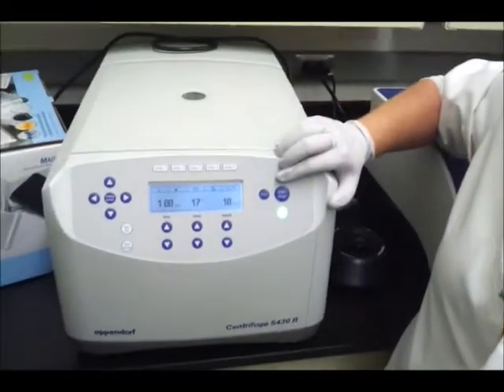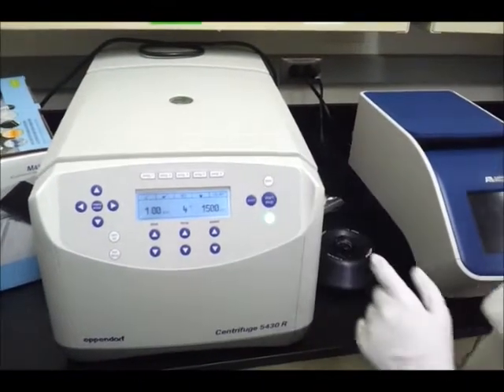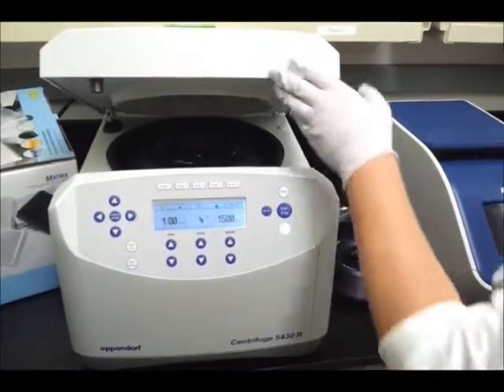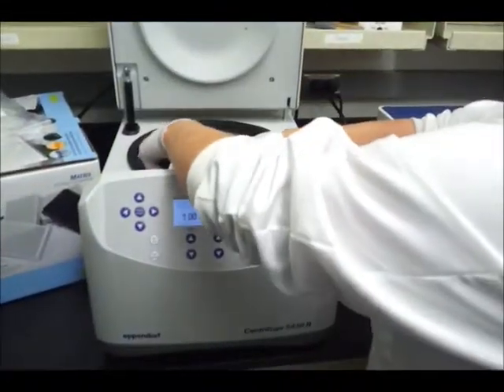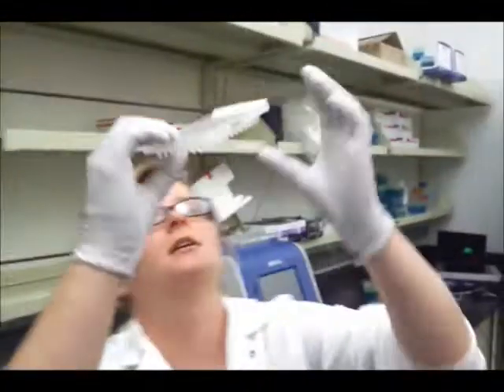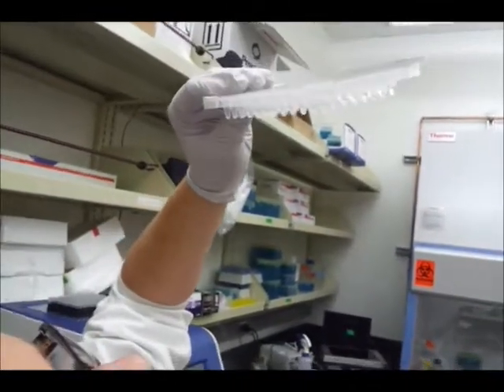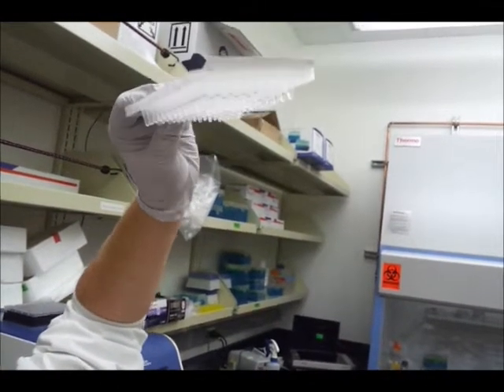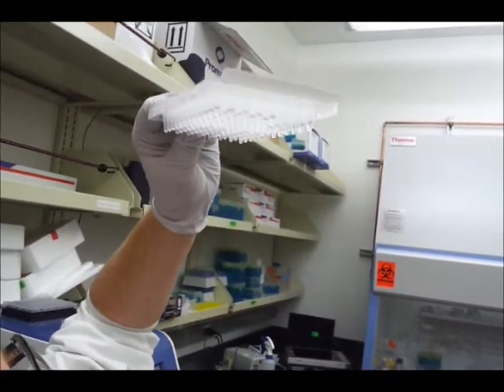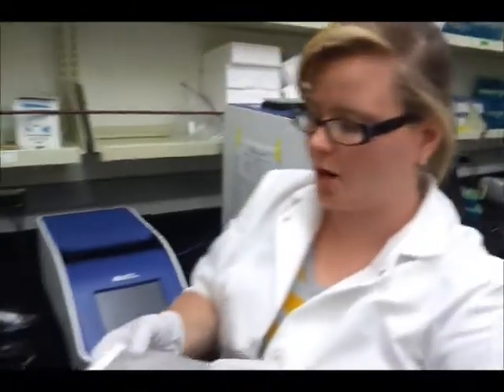It's done. Okay, check it out. We'll look at it, make sure that it has spun down properly. If not, we'll redo it. So right now I'm just going to look at the plate, and I'm curious, are there any air bubbles? Are there droplets on the sides still? Have I not spun it down long enough or fast enough? Everything looks awesome. So this plate is ready to go into the qPCR machine.